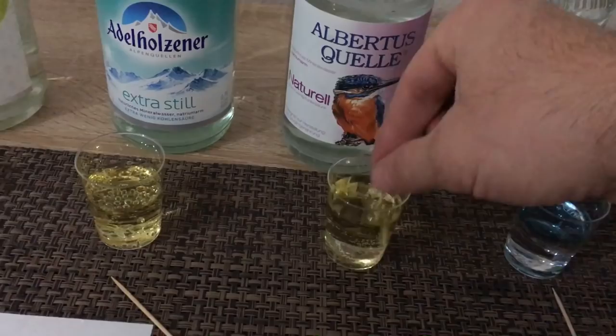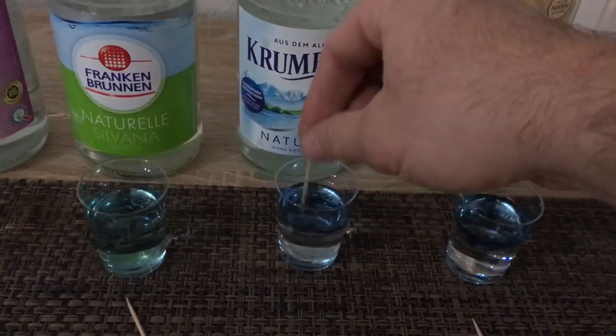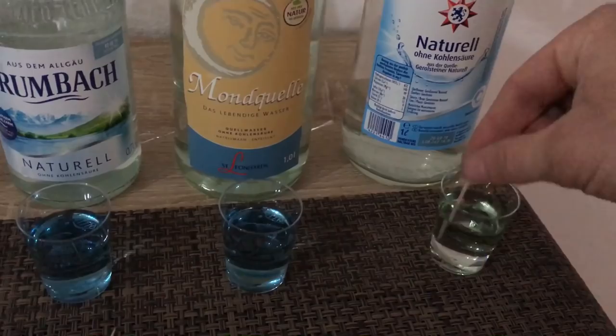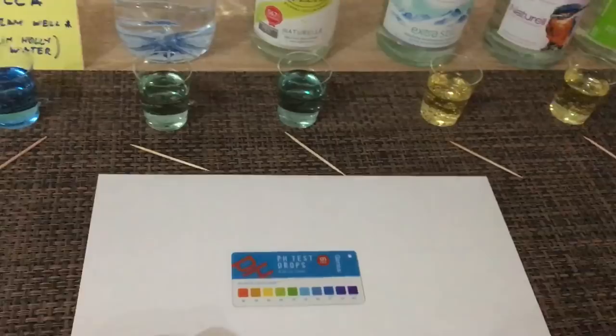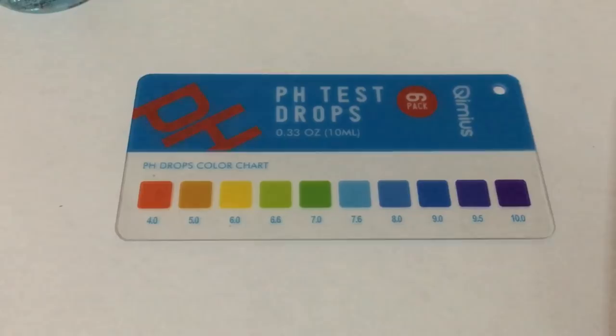I'm pretty disappointed, I have to say, from the looks of some of them. Like I said, I'm not a scientist, but I guess I play one on YouTube. So let's see what we have — here is the coloration chart. A nice little blue; if we look at the level here, I would say it's a 7.6 pH level — that is my tap water from home.